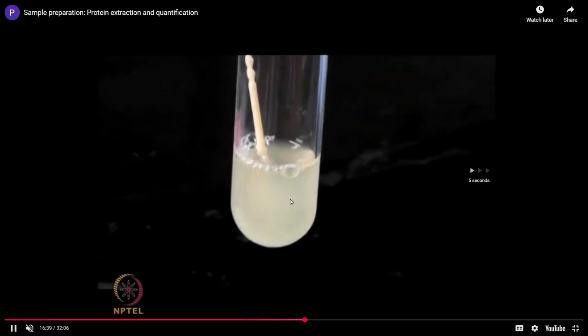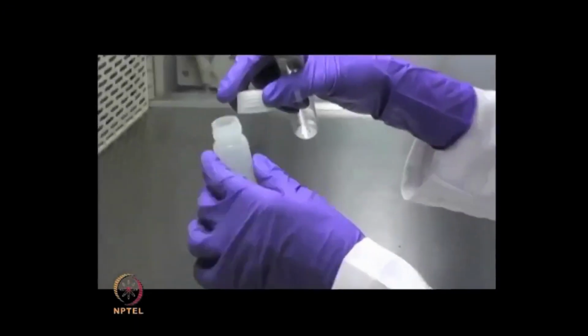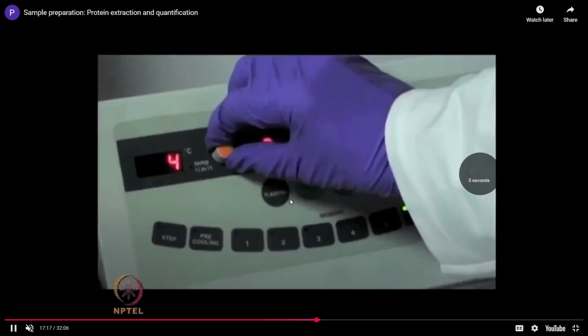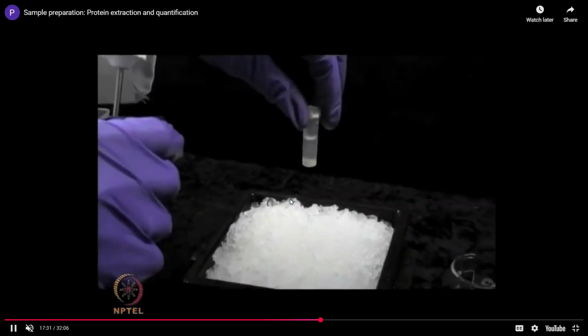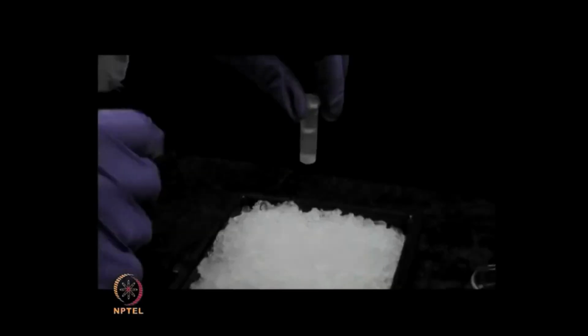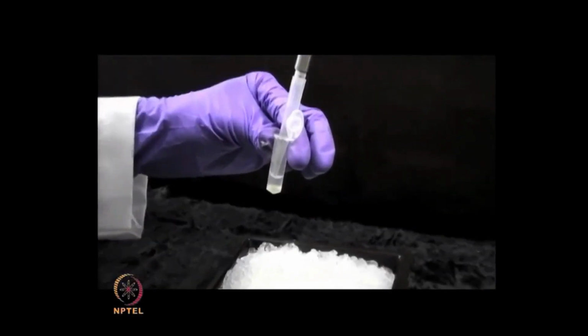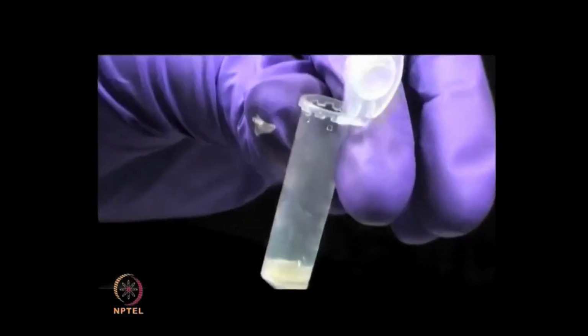Once the culture is grown, you will take the sample and centrifuge it. Once you centrifuge it, a pellet is obtained, and that pellet is resuspended in lysis buffer. You also need to wash the pellet so that the media is washed away and there is no media present.